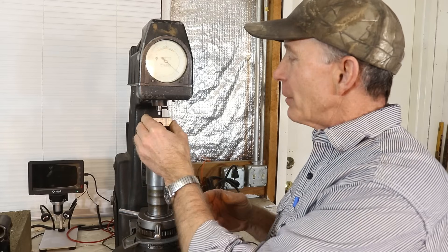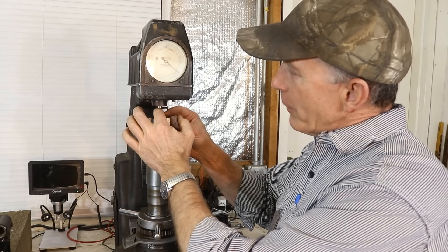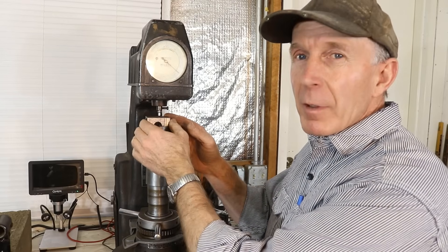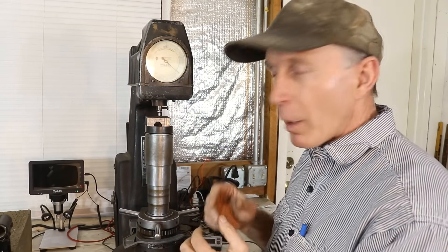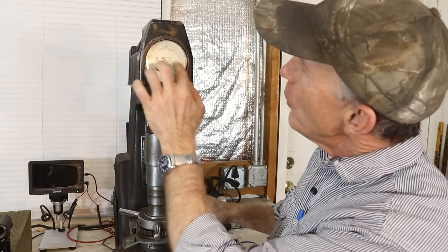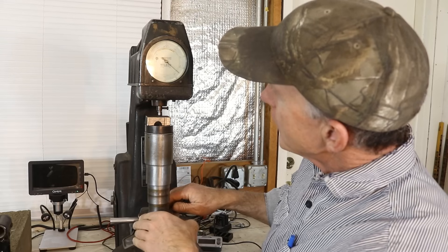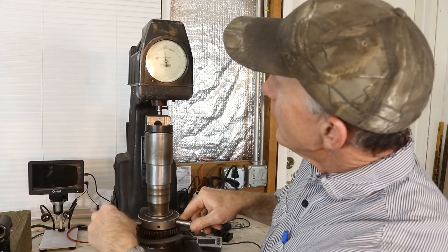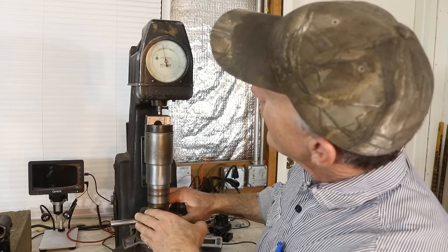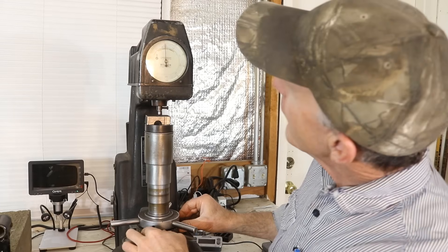I grabbed a piece of scrap mild steel from the shop, set it up on here, and make sure everything is good and clean. We've got a hardened steel penetrator here. If we were testing tool steel — something really hard — we'd need a diamond tip one, and that would work in the C scale. We're working in the Rockwell B scale. So we get it up here and then we're going to preload it. There are two needles — we preload until both are pointing straight up. There's a little one with a black dot, and when we're straight up, we can adjust the scale with the thumb wheel to get it there.